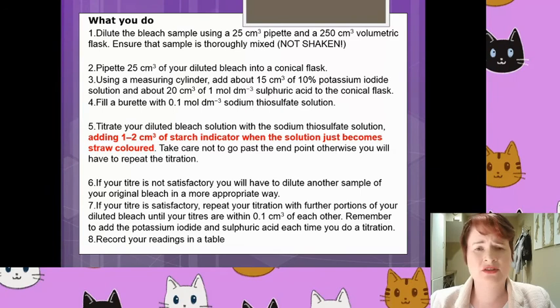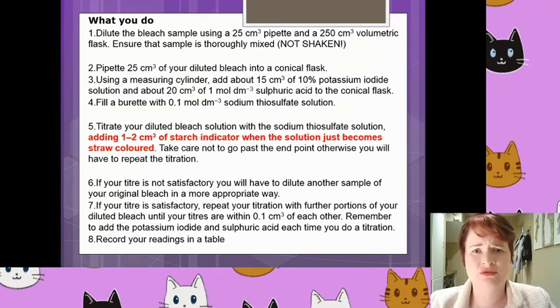The rest of the stages are the usual for the titration: lather, rinse, repeat, and keep repeating until you get concordant results.